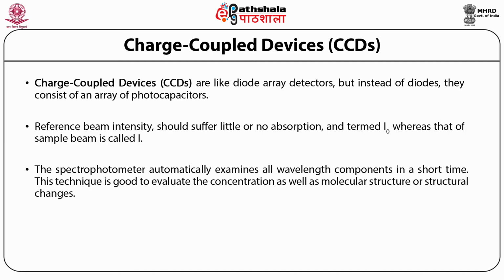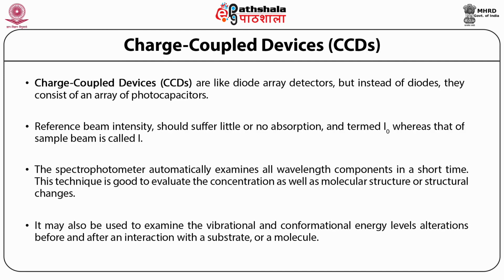This technique is good to evaluate the concentration as well as molecular structure or structural changes. It may also be used to examine the vibrational and conformational energy level alterations before and after an interaction with a substrate or a molecule.